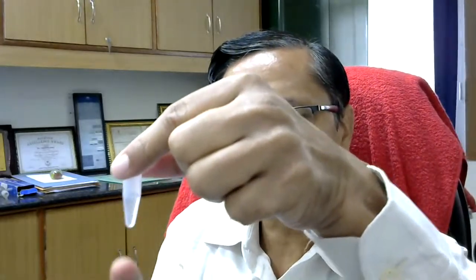Okay, so if a little bit of material is there, it will go and stick in this bottom. If you try to mix it, mixing will be a bit difficult. So for pelleting, it is easier, but for mixing, if you want to mix something, this will be easier, so that you can close the tube like that, and then by doing this, you can mix it very well. But that sort of mixing in case of this tube will be a little bit difficult because this is conical type of bottom.